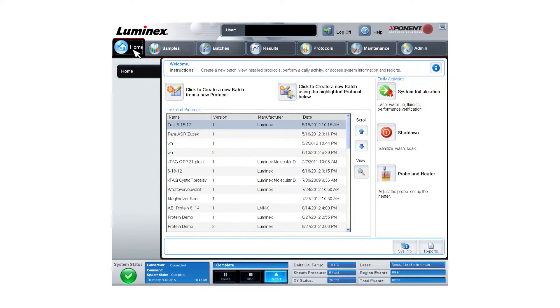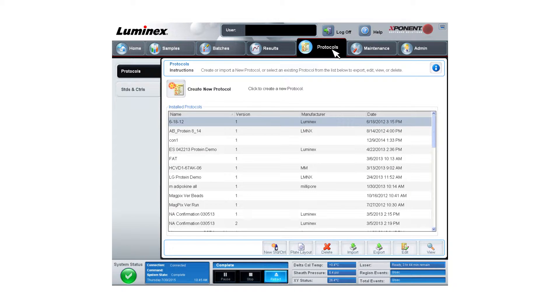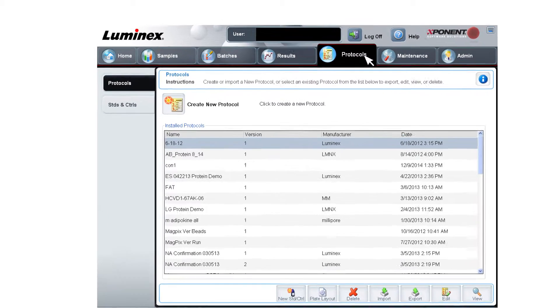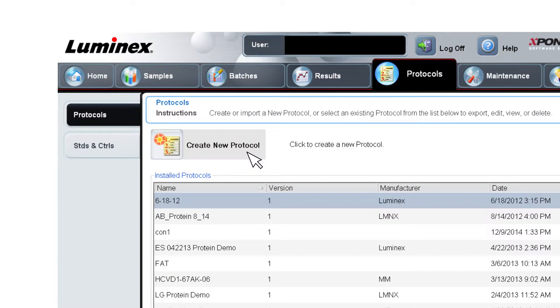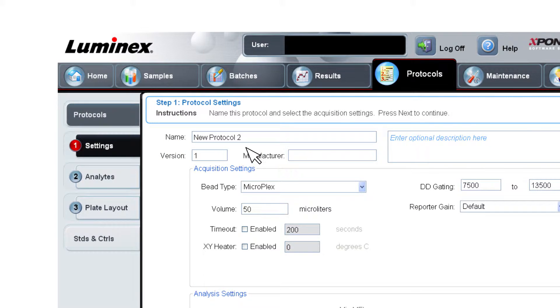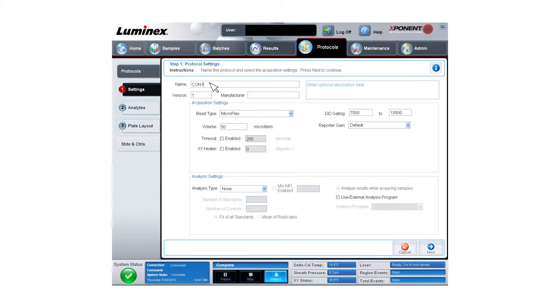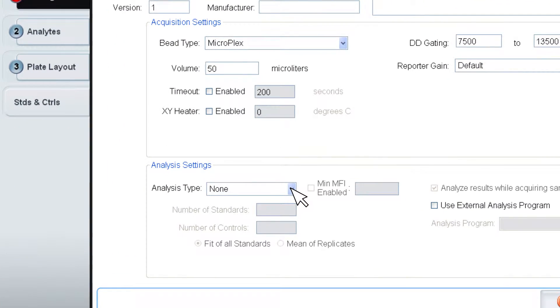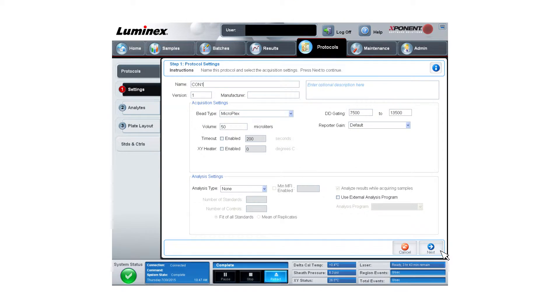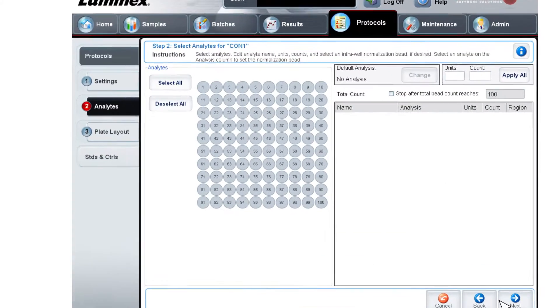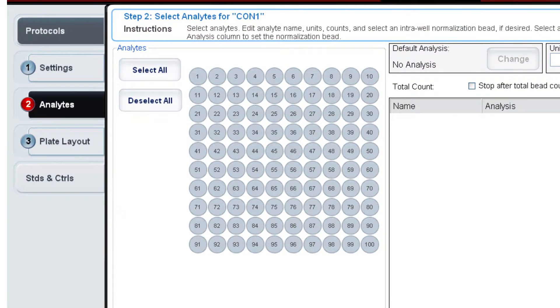The next step is creating a new protocol. Navigate to the protocol page in the Exponent software and click the Create New Protocol button. Enter a name for the protocol and keep all settings at the default. The analysis type should be None. Click Next and select the following regions on the Analytes page.